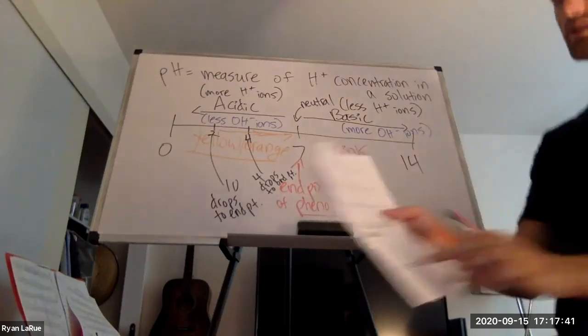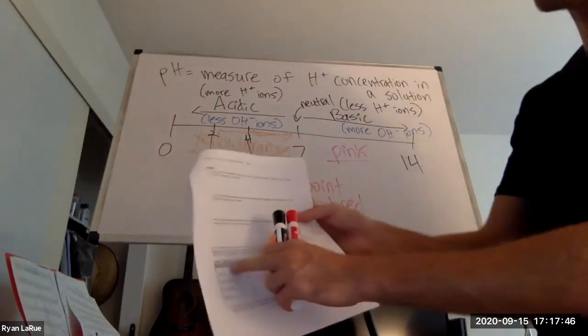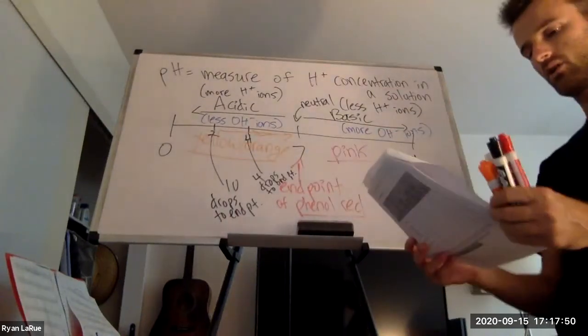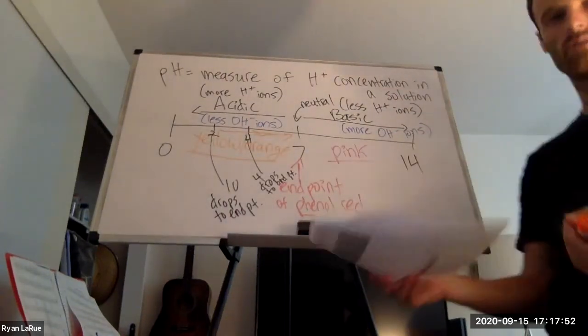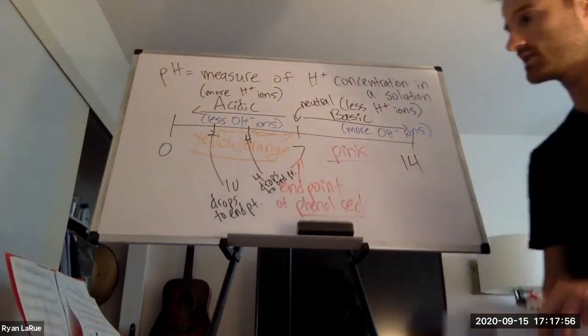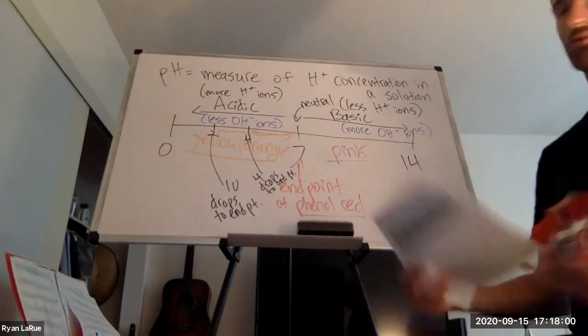And I believe Stacy will also, this is on page 7, table 4. If it's your page 7, it's table 4. She uses pH test strips to determine the real pH of these different solutions. And so you can see if you're accurate or not.